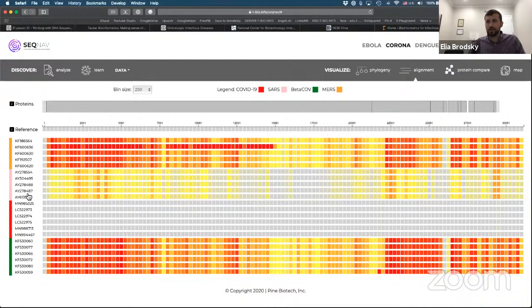Now we see here this group, SARS, has the least differences, right? These are 0 differences, so whole sections are actually identical to here. And some of these contain a smaller number, so smaller in the tens. If we go over to the MERS, this has hundreds of changes. So it's obvious if you look at this image that SARS is the closest to COVID-19.